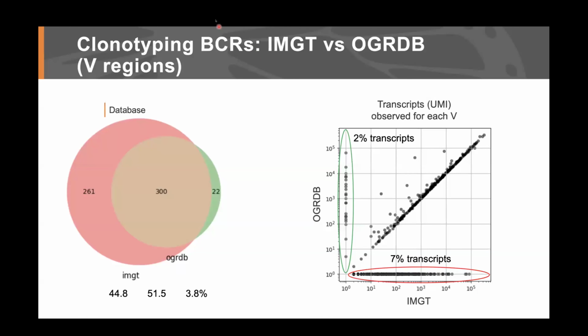Yes and no. I think the point to think about is that IMGT is a bigger database, right? And sometimes when you have more sequences in your germline database, you will just get more calls. But that doesn't mean that those calls are legitimate. If those are, for example, poor alignments, then you may be getting that call just because your database is lacking a true allele that your sample has.